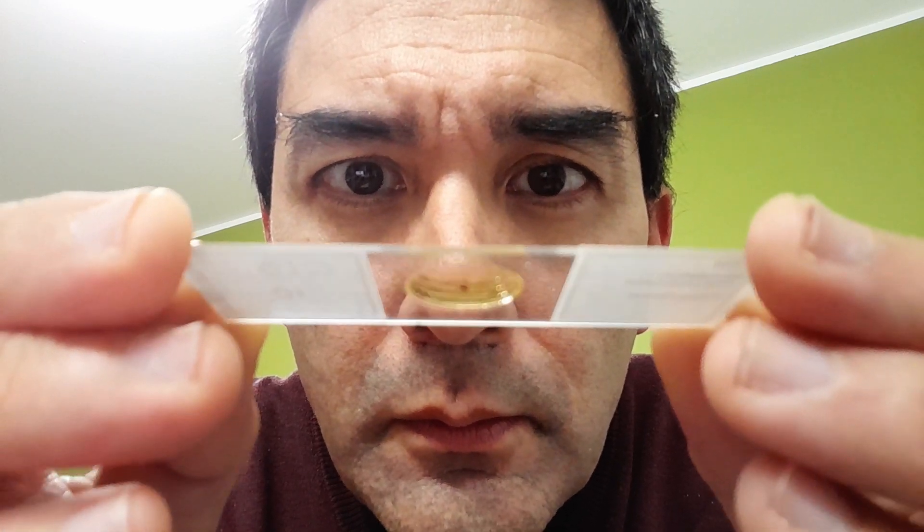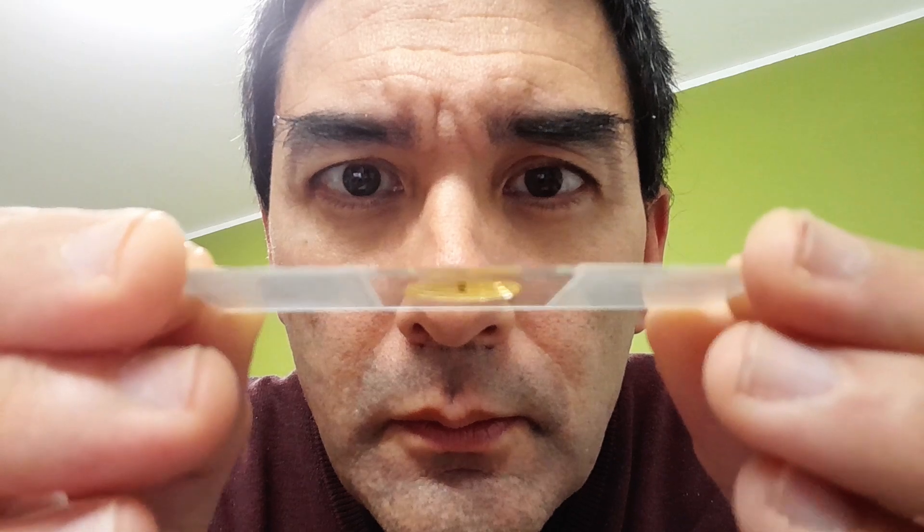I think this might be an adaptation that's also often overlooked. Fleas have a very aerodynamic shape. They are quite thin and this reduces their air resistance and this way they can actually jump much further.